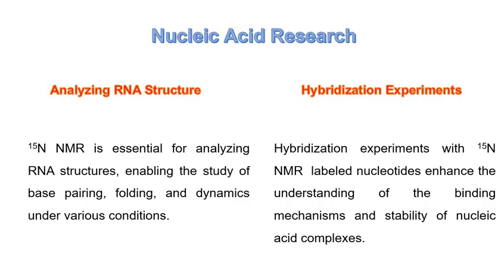It offers insights into the stability and conformational changes during the hybridization process. Hybridization experiments with N15 NMR labeled nucleotides enhance the understanding of the binding mechanism and stability of nucleic acid complexes.